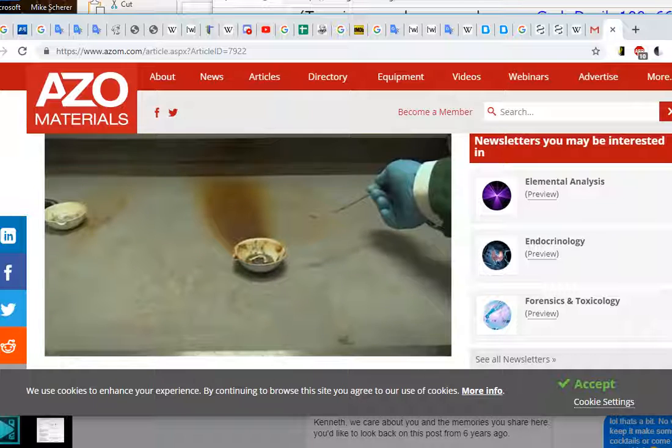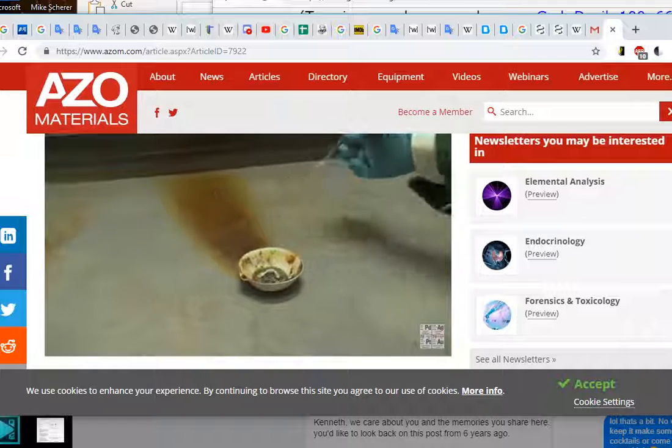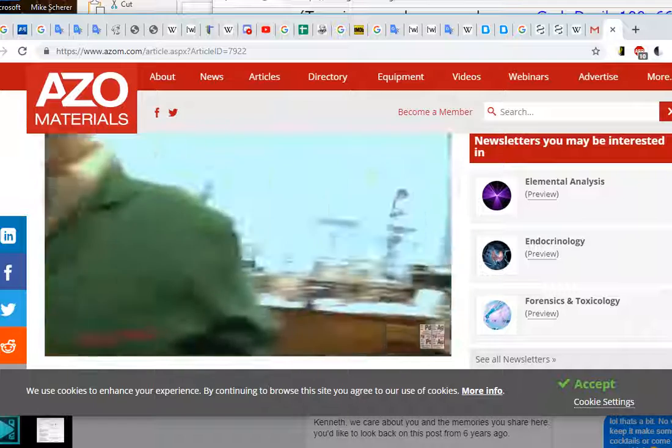So, sadly, we've managed to stain the Stig's fume cupboard. All of this really nice iodine forming a very fine layer across this fume hood. What do you think about that?